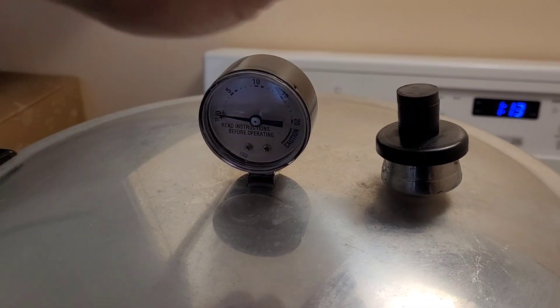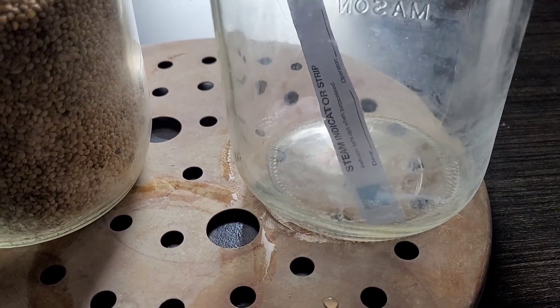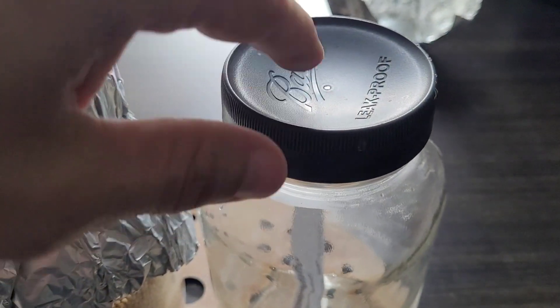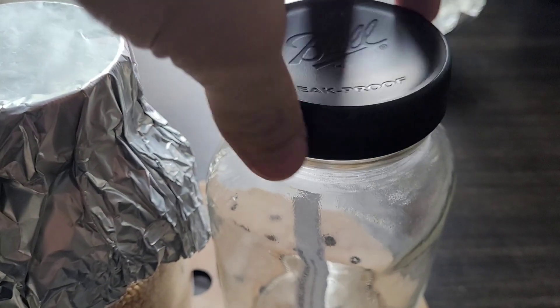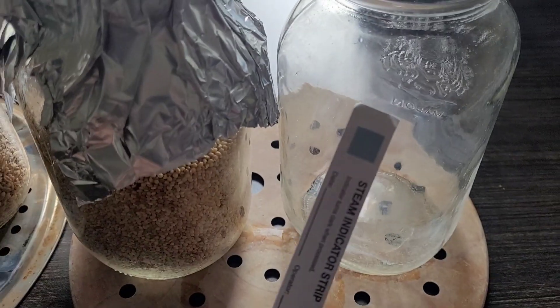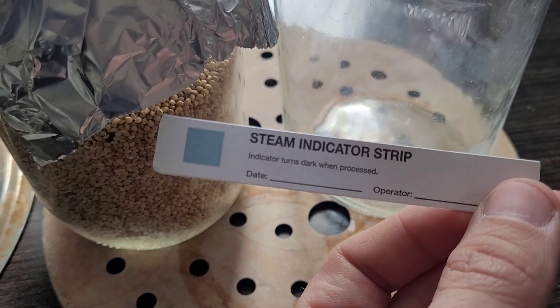I ran this for 90 minutes at 15 psi. Fresh out of the pressure cooker, the first thing I notice is no change on the indicator strip in the sealed jar — but the lid is severely concaved. It clearly pulled a vacuum and warped the lid. The strip itself is not affected, so we now know it is steam alone that triggers the tape and not temperature.